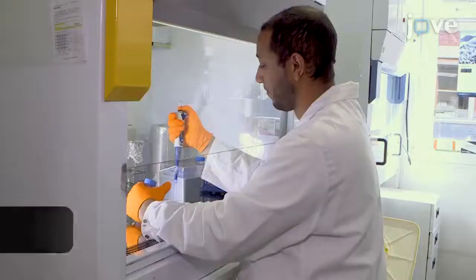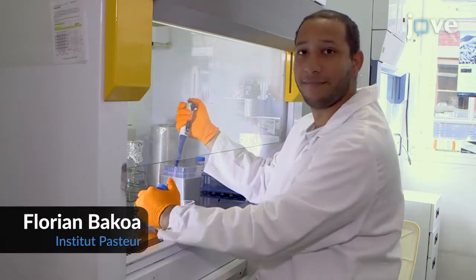The addition of the mini-brain to this blood-brain barrier or BBB model allows the study of how pathogens and molecules that cross the BBB behave in the brain. Demonstrating the procedure will be Florian Bakoa, a PhD student from my laboratory.